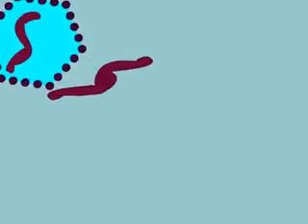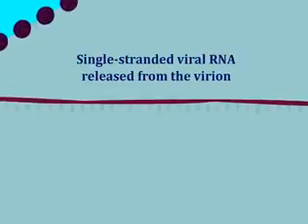The answer is that RNA from an RNA virus can be quantified after it has been copied and converted to double-stranded DNA. This animation shows how this is accomplished. First, the viral RNA is released from the virus.